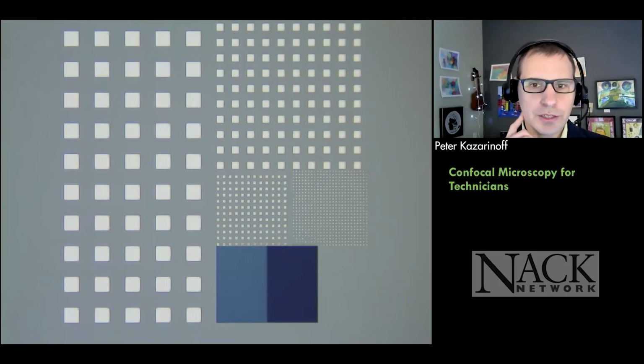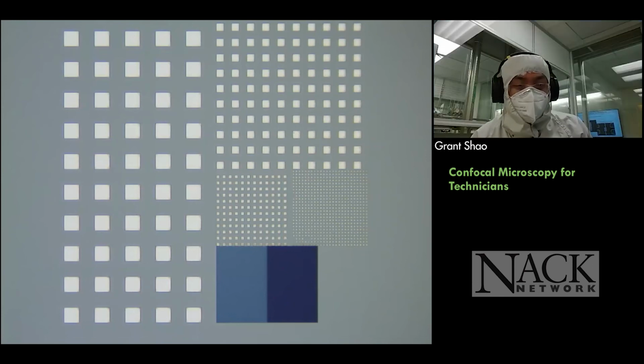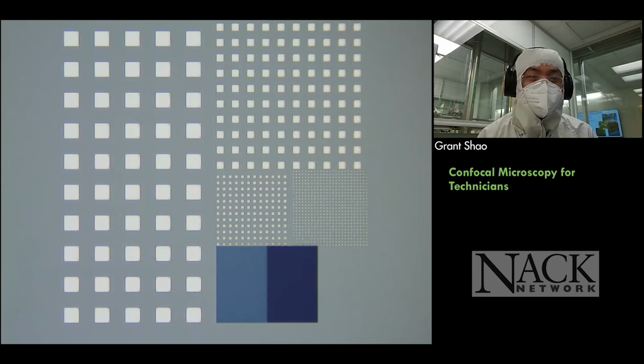For your instrument in the clean room, what's your practical XY resolution limit, and what's your practical Z resolution limit? It's a good question that I don't really have an answer for. I know the manufacturer specification: I think the XY resolution is 25 nanometers, and the Z resolution is 5 angstroms. But we're in the clean room and it's super loud, and the acoustics make that not accurate. So, I'm not entirely sure.